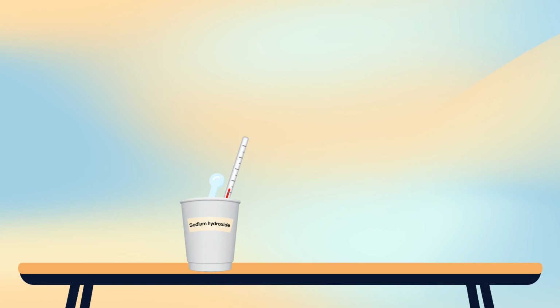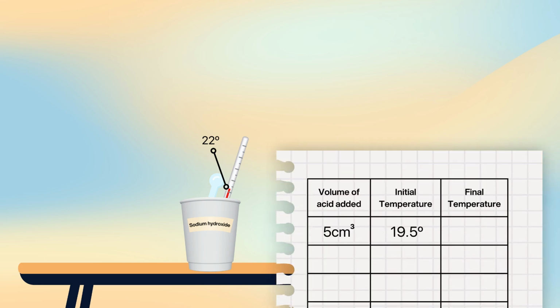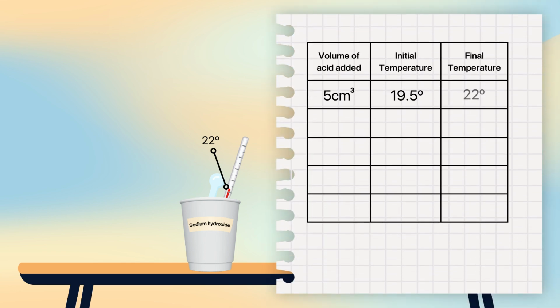The temperature from this reaction is 22 degrees. So let's add this to our table, writing the final temperature of 22 degrees in the correct column.